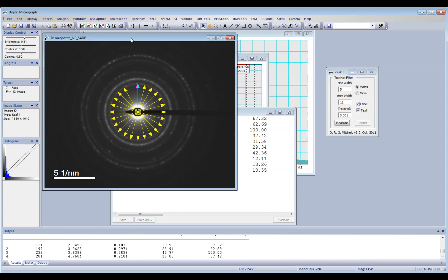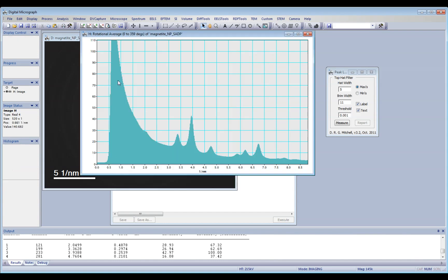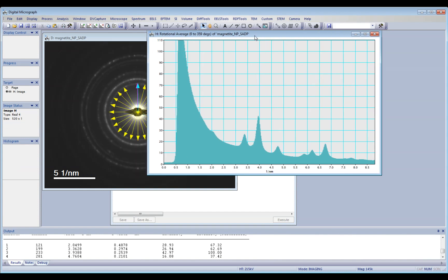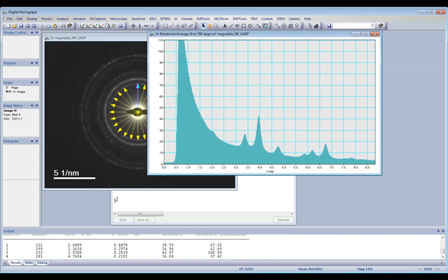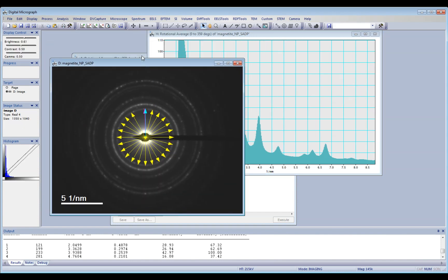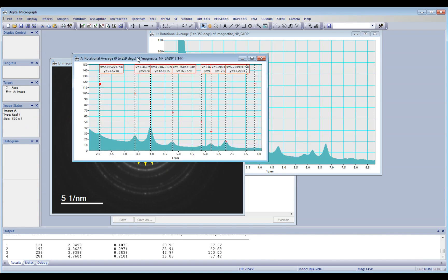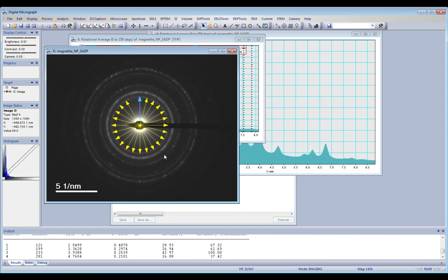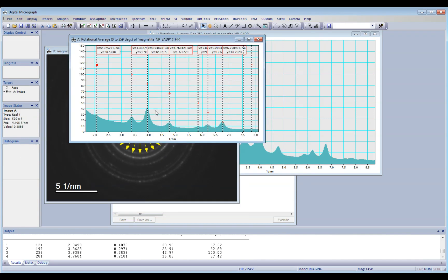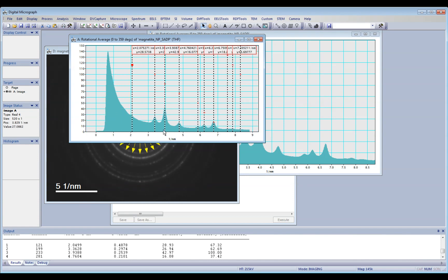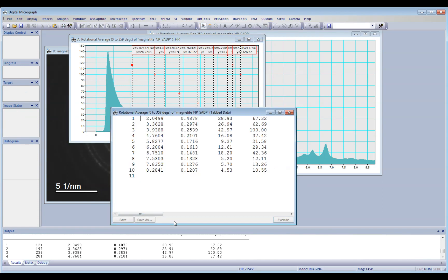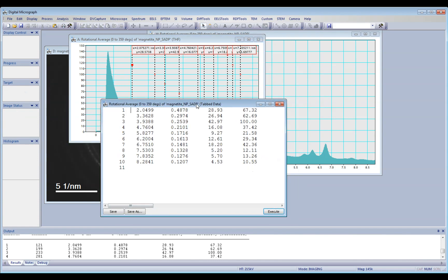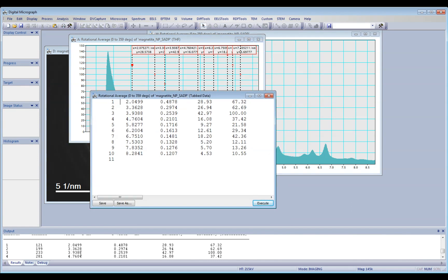So in the first video, I showed you how to centralize the diffraction pattern, how to find the center, how to generate the rotational average, the line profile, and how to measure the peaks, actually the rings, this peak chart, and how to report the results.